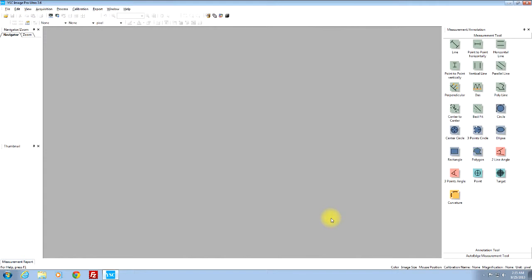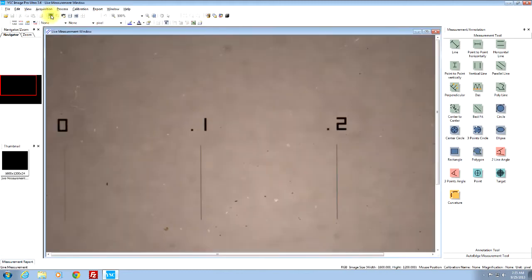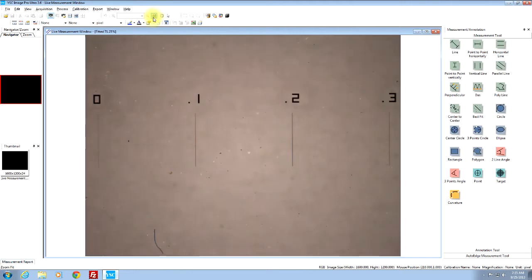Here's how you do the manual calibration. Open up your program and click on the live measurement mode. You can use the video mode so you can see the whole stage micrometer. Click on the manual calibration.